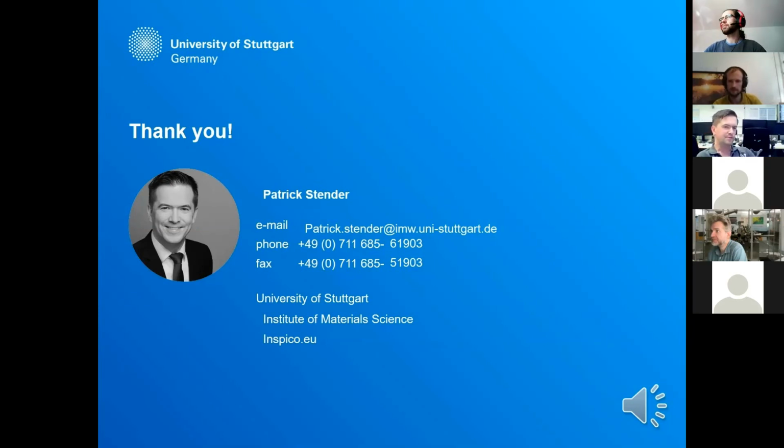Yeah, using 64-bit, we have milliseconds accuracy with the epoch time, but we have this pulse window indicator, which gives you a unique identifier after every laser pulse. So you can decide in between every laser pulse. The time is just more for getting quick data on how the measurement developed over a long period of time. Okay, thanks very much.